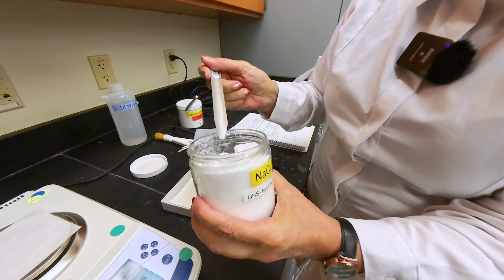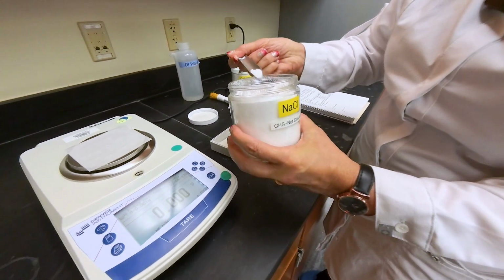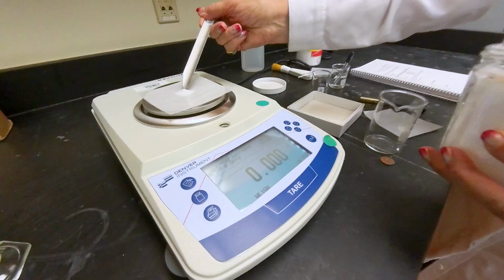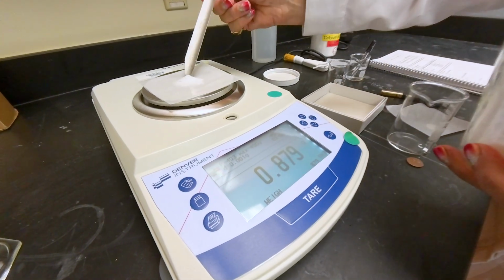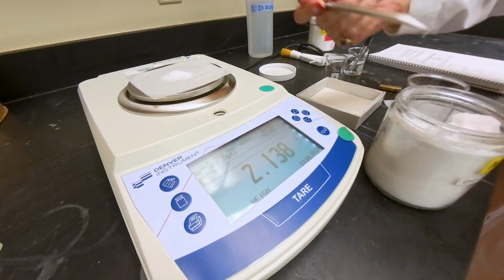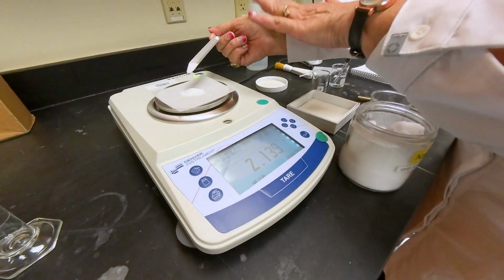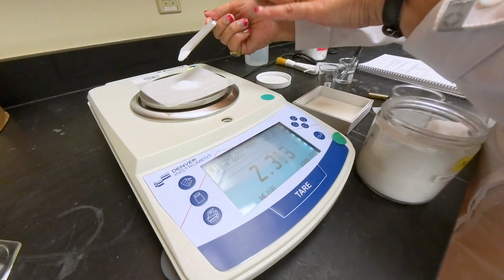So you are going to use a clean spatula, and since it's NaCl, that's the compound that I have here, I'm going to take a small portion at a time and add until the mass reaches 2.750. And it's not going to be easy, because getting exactly 0 at the end might be challenging, but watch me. I'm just adding small amounts at a time until it gets to that point.